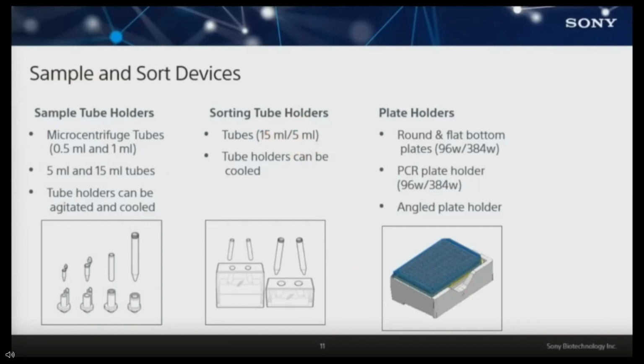Again, you can also set this up to sort into an Eppendorf tube if you want to, or even, as I witnessed the last couple of weeks, people will sort into yeast culture tubes directly in the tube holder. Again, collection can be cooled. Plate holders are designed for a variety of plates, so no specific plate is needed.